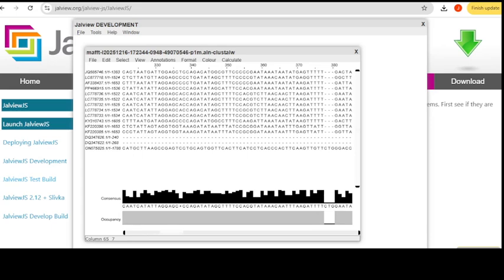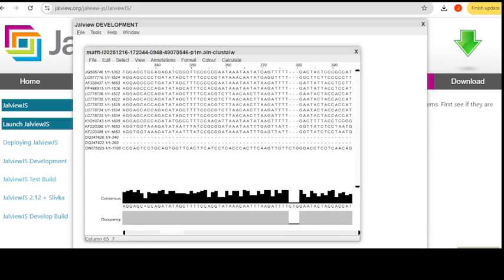you see actually the occupancy. It means how much is occupied. Okay, if you look at this, this is occupied quite well. These T's, right, or all these reads on this side. But if you look at this area right here, it is not occupied. So if you look at the depth, it's giving you there is only one read here in this particular location.